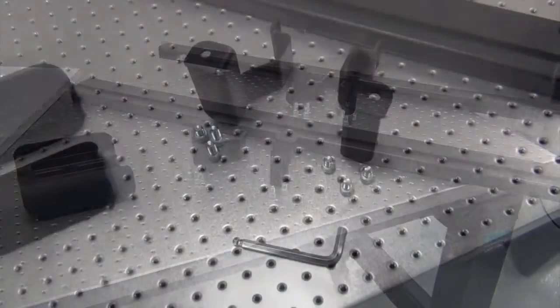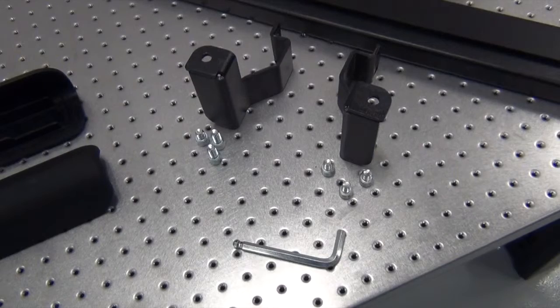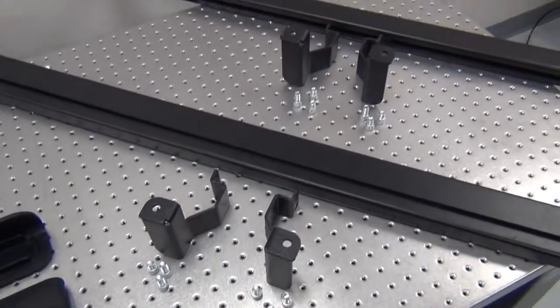There's a left bracket, a right bracket, four short bolts, two long bolts, and a hex key included with each kit.